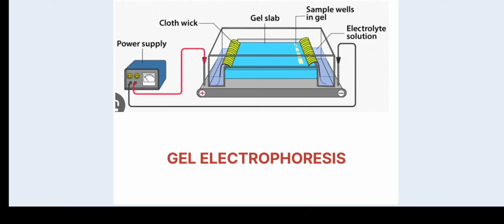Today we are going to discuss gel electrophoresis. So we know that electrophoresis is the migration of charged particles or molecules in a medium under the influence of an applied electric field.